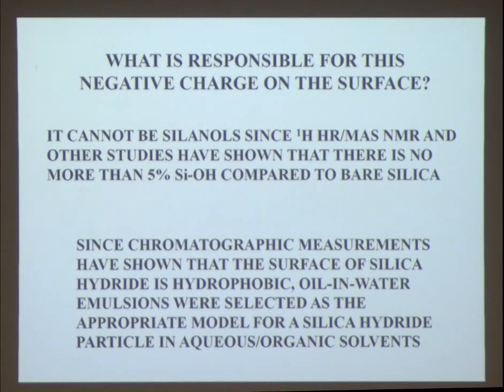So we said, okay, maybe this is a good model for us, because remember, silica hydride is basically hydrophobic, so it kind of acts like an oil drop in an aqueous solution. And so we began to pursue this a little bit further to figure out a good explanation for it.